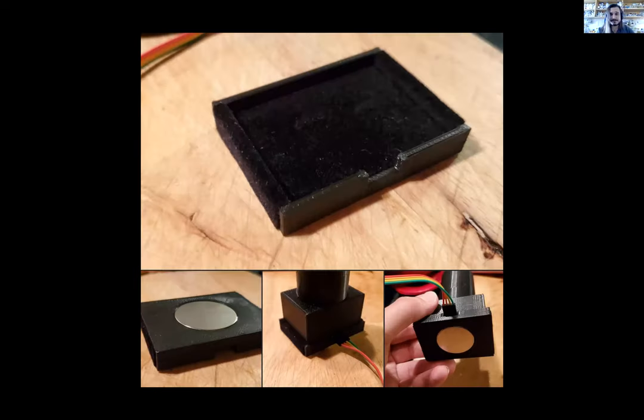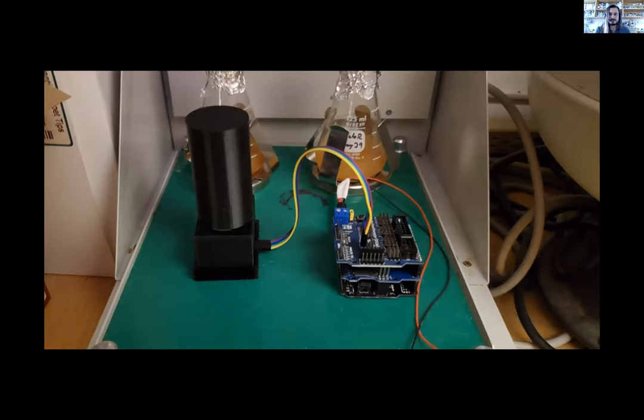And because I was designing this, I'm just like, why don't I make everything like kind of like Legos in a way, and friction fit all the parts together using old-timey analog camera light seals using black velvet and magnets. So the entire device, there's no screws or anything. It fits very snugly. All you have to do is replace the velvet every like maybe 2 years, and it's extremely cheap if you need to. Attach it to a magnet, throw it on your shaker. This is one example of it wired up.